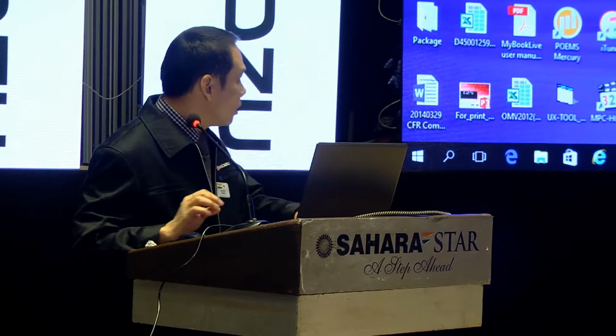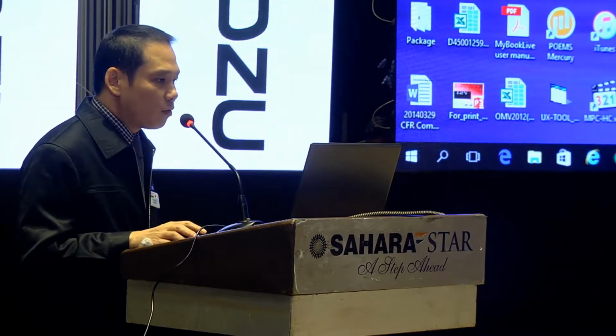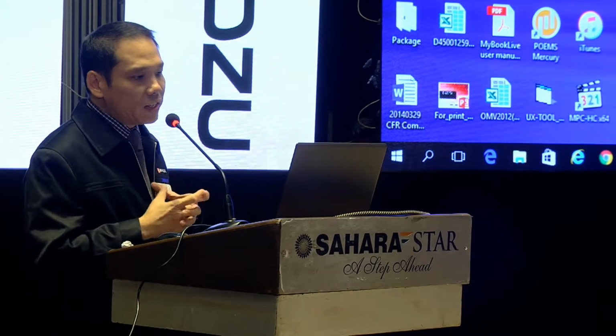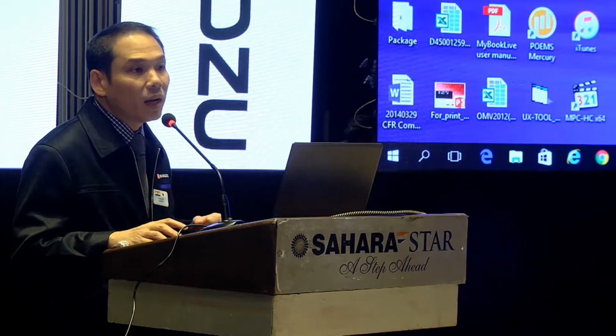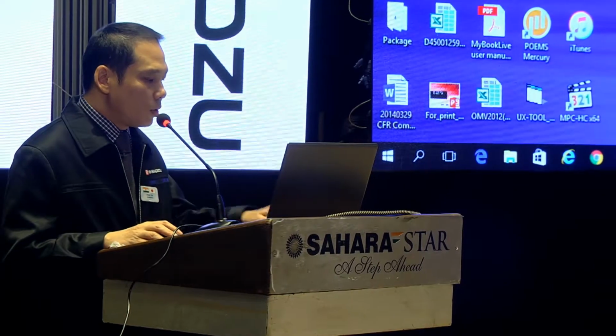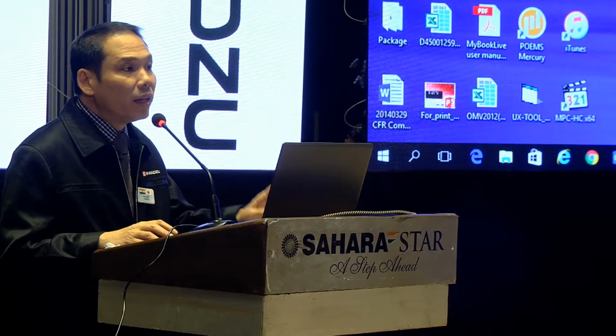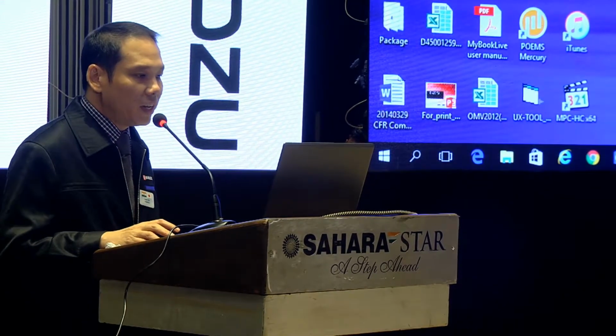So for Lab Solution DB, when you purchase the Lab Solution DB license, you will also have the license for Lab Solution DB Data Manager.